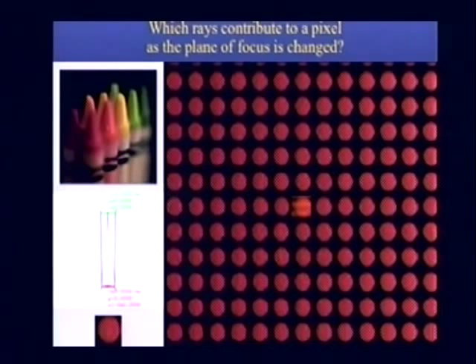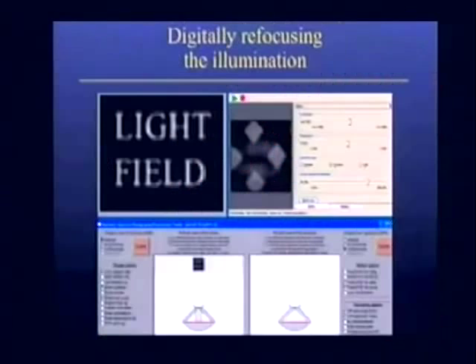So as we begin to change the focal plane, so I'm going to move the focal plane here, the samples that I'm taking begin to borrow from adjacent microlenses. That's the essence of the digital refocusing. And the more I begin to borrow from adjacent microlenses in a particular pattern, the more I move the focal plane, and the more the single pixel at the center of the crosshair there changes to one that's in focus.